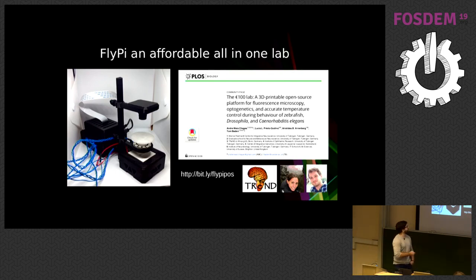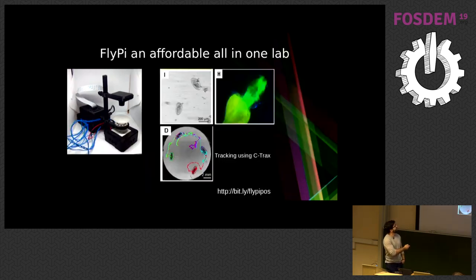And basically what this is, and I'm going to show this in a little bit, basically this is what you can do with it. So these are 200 microns, and these are parasites that you can find if you drink bad water. So you can use this for diagnostics. You can also use this on a macro scale and not a micro scale anymore to analyze or record the behavior of small insects or small mammals. And you can also do fluorescence.